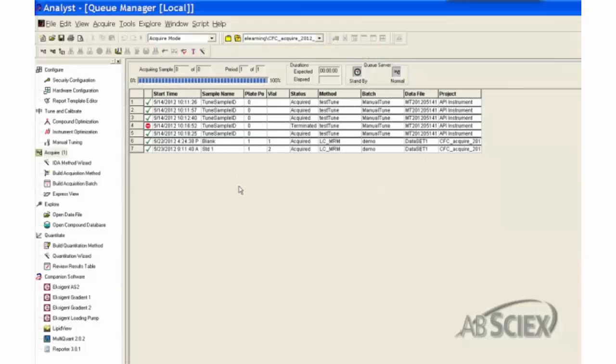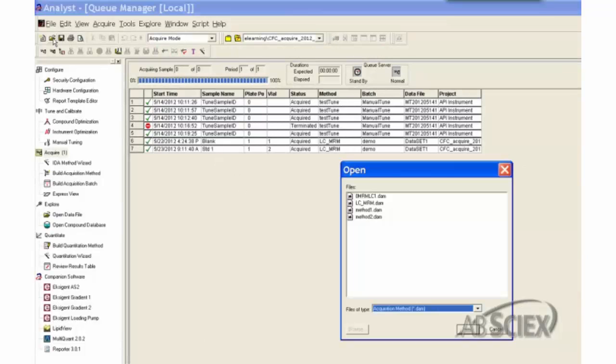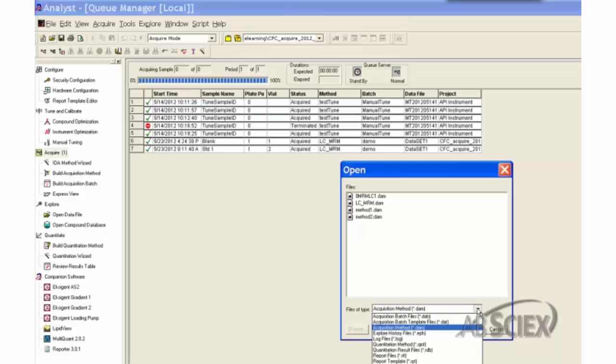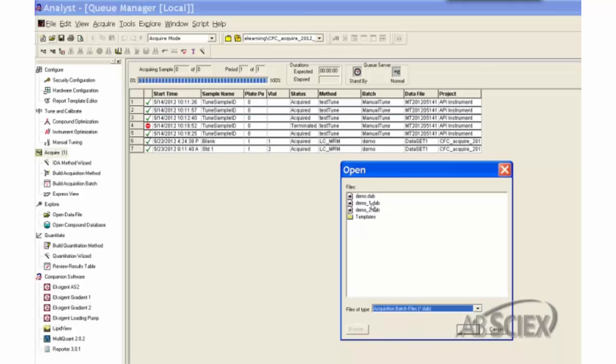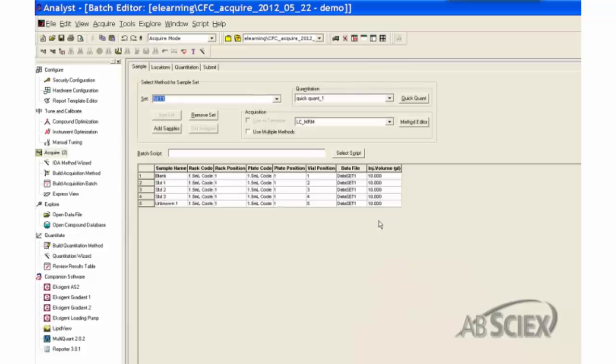After the acquisition batch is created, the samples are ready to submit for analysis. Open the pre-saved acquisition batch, then select the submit tab of the batch editor window.